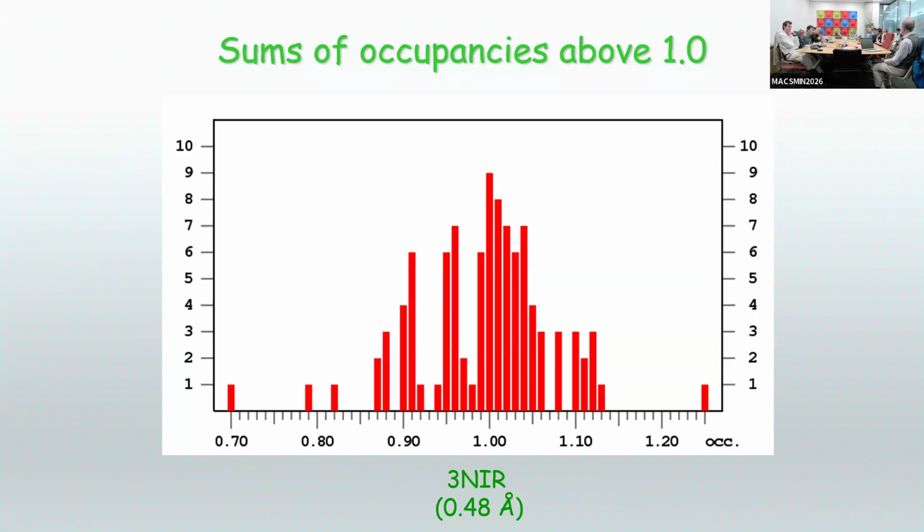But that's not how these models have to be deposited. And of course, that's not how we deposited them at the end. Here, they were just rough model from refinement was deposited, and that's why you have those occupancies more than one.